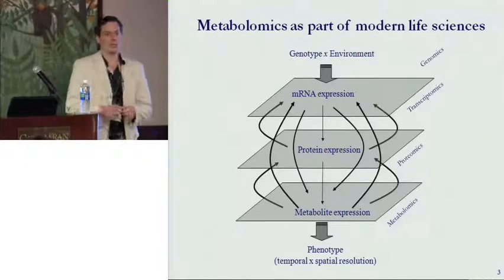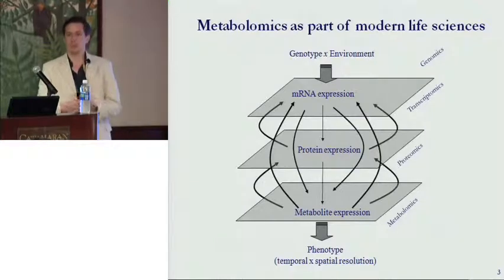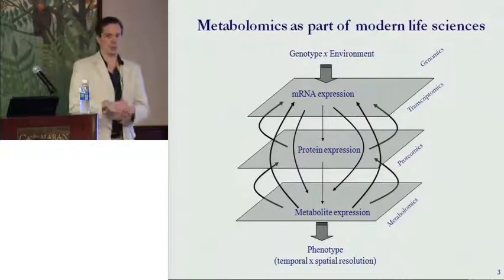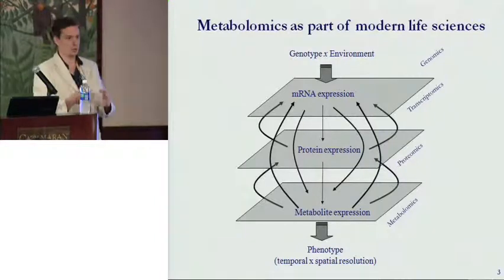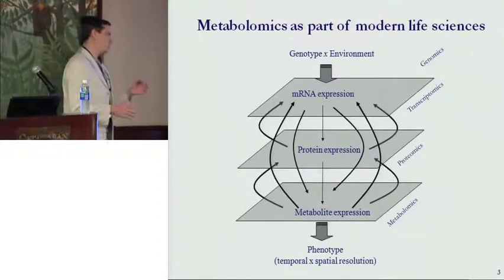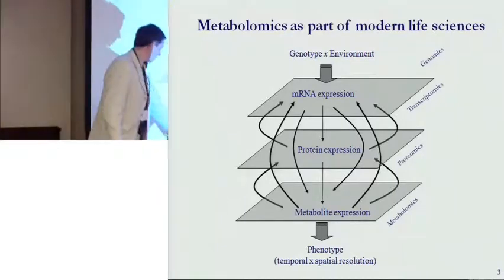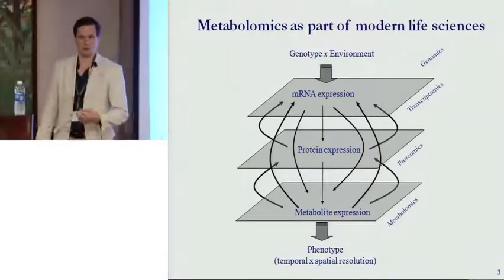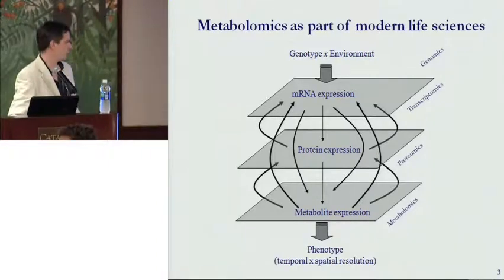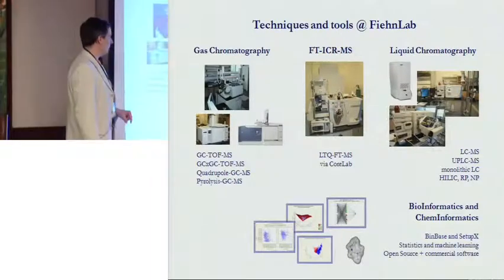So we are looking at a number of, let's say, 1,000 compounds at a time and trying to identify sugars, amino acids, small fatty acids. So if you're coming from the drug industry, you would usually look only for 10 targets after administration of a drug in the serum. We look for the whole range of metabolites, at least we try. And what we do with metabolomics profiling is we take temporal and spatial snapshots of the metabolic states of plants and humans and bacteria and possibly also viruses. And we're doing that with a range of mass spectrometry and NMR technologies.